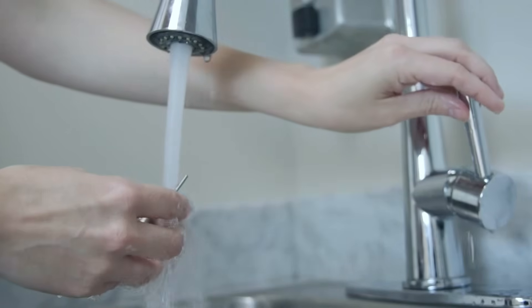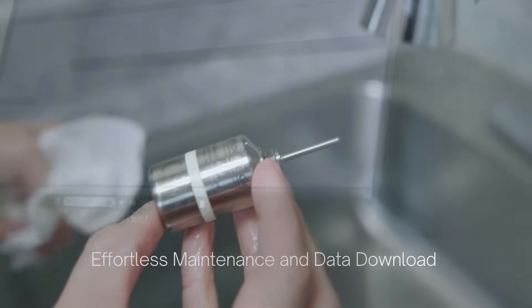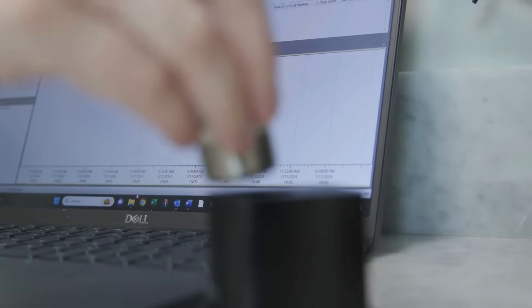After data collection, simply remove the HITEMP 140-CF from the can, give it a quick rinse and wipe down, and then download your data onto MAJTEC 4 software.